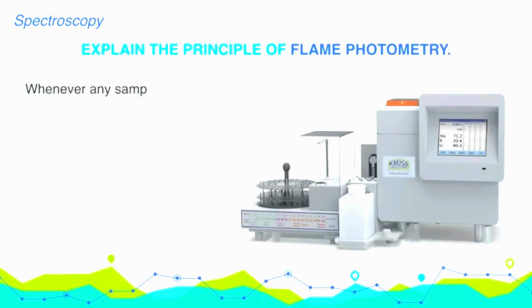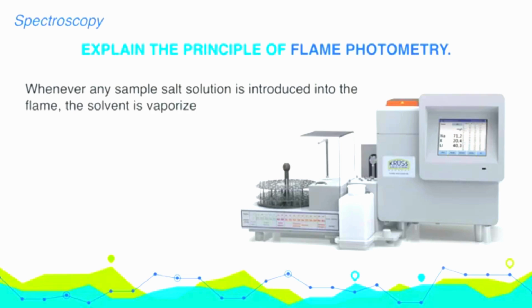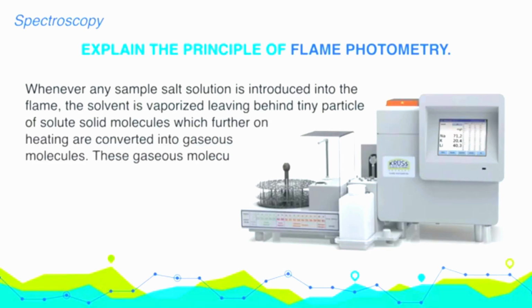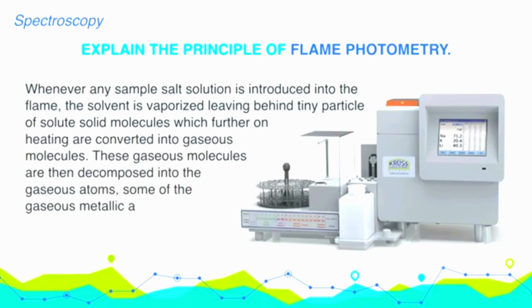As we all know, whenever any sample salt solution is introduced into the flame, the solvent is vaporized, leaving behind tiny particles of solid molecules, which on further heating are converted into gaseous molecules. These gaseous molecules are then decomposed into gaseous atoms.